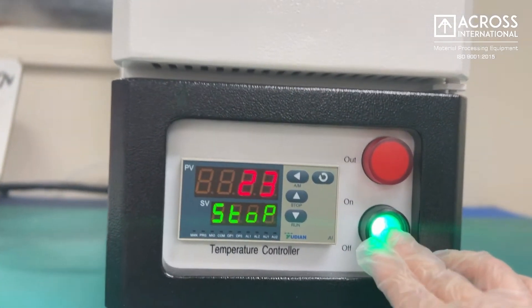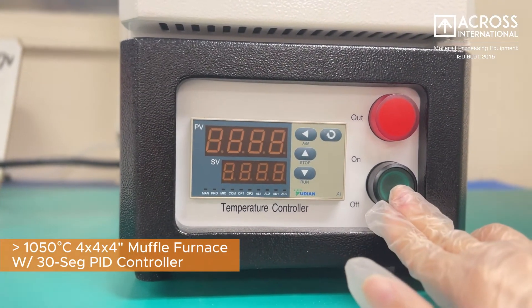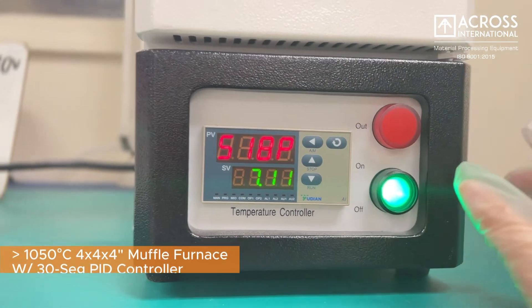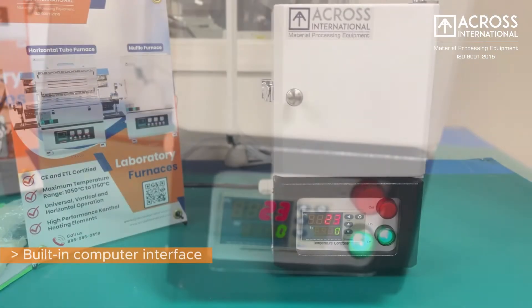Across International Compact Tabletop Muffle Furnace is configured with a 30-segment programmable temperature controller for setting up to 30 target temperatures over time, up to 1050°C.